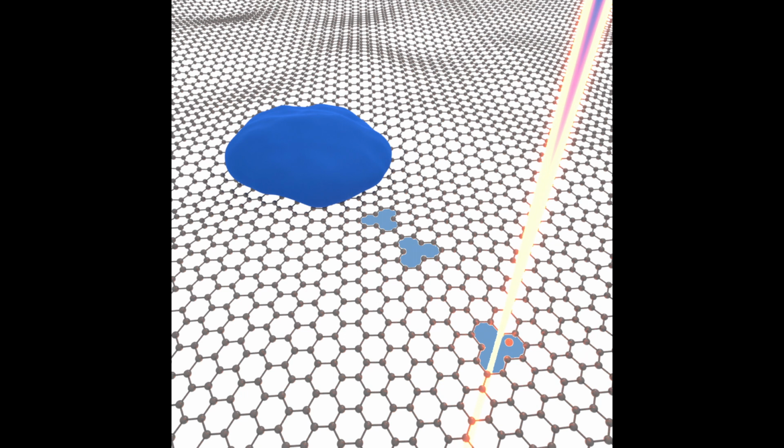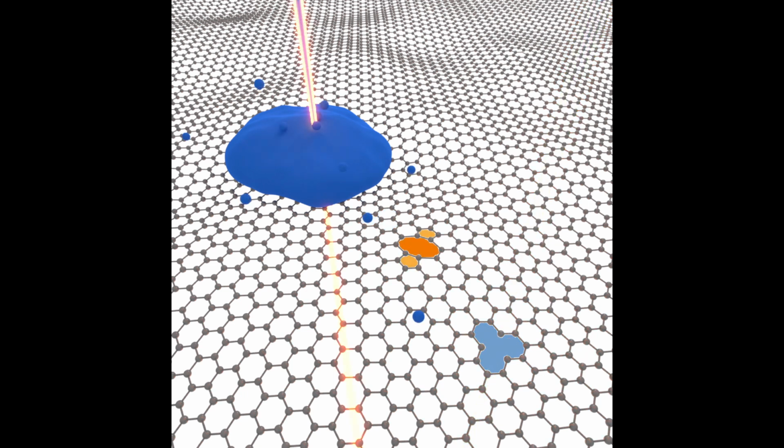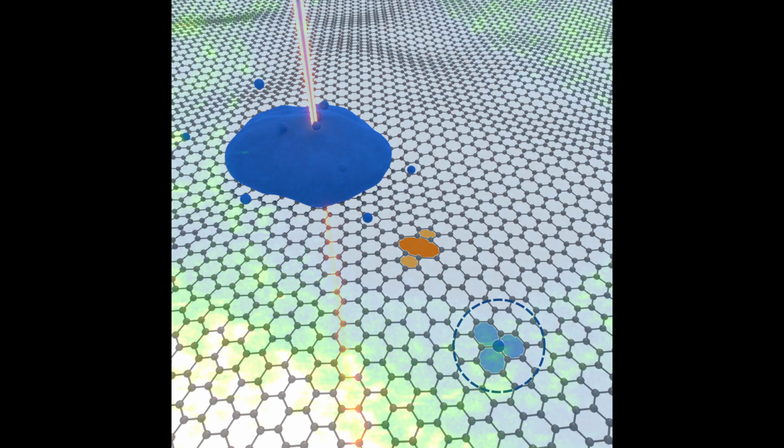Carbon atoms from the lattice are ejected, creating vacancies. The beam is then moved back to the parent nanoparticle and used to sputter atoms off the nanoparticle and onto the graphene surface, where there is some probability they will diffuse to the vacancy site and become chemically bonded to the graphene lattice. Here is the initial configuration.